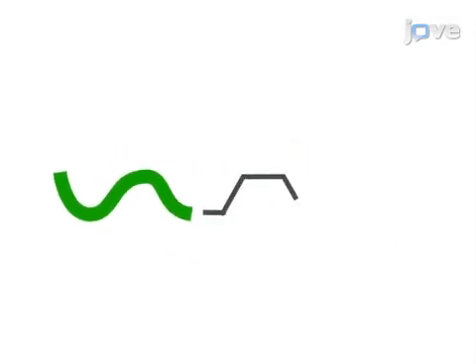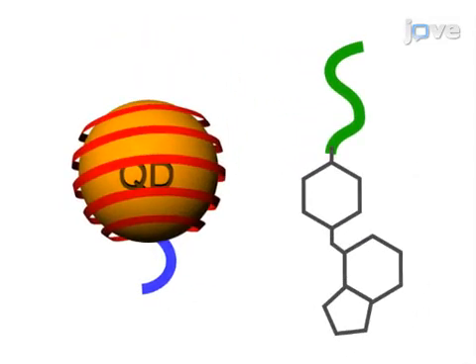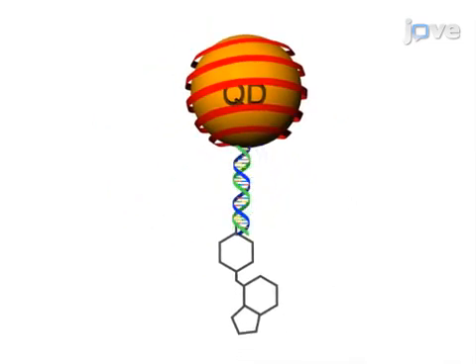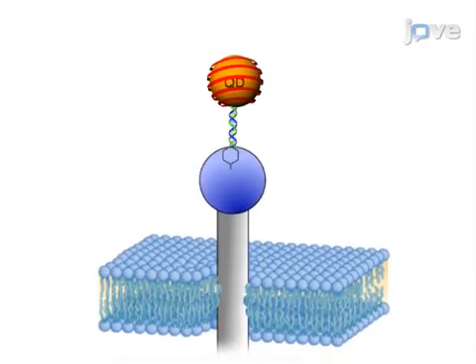Separately, benzylguanine functionalized DNA bearing complementary sequences is prepared to target snap-tagged membrane proteins expressed on live cells. Next, the sequential treatment of live cells expressing snap-tagged membrane proteins with benzylguanine DNA followed by monovalent quantum dots leads to selective labeling of the targeted receptor.